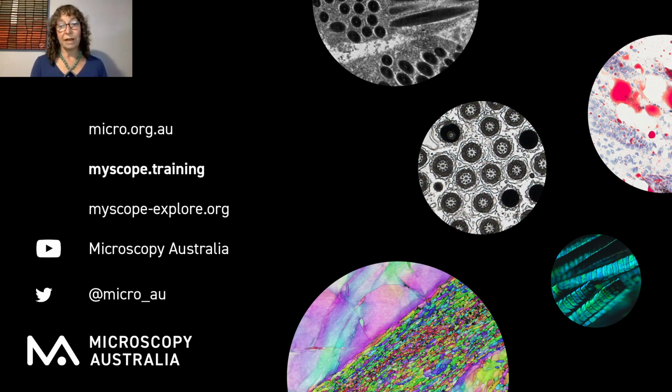MyScope Explorer, on the other hand, yes, the whole idea is for kids to get in there and make lots of discoveries of lots of different kinds of samples. So for the kids, it's a tool to make discoveries. MyScope is a tool to train people how to use an SEM.